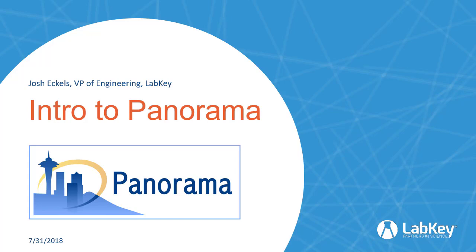And this is where we decided that we would build Panorama, which is a module within LabKey Server, built on top of this existing framework that had things like security and a well-established API. If you're going to build a house, you want to make sure you put it on a solid foundation. And this was basically the idea: we build this on top of LabKey Server. So we partnered with LabKey.